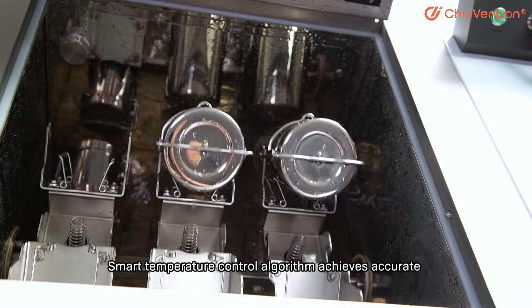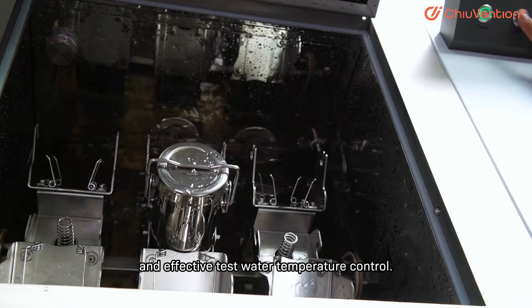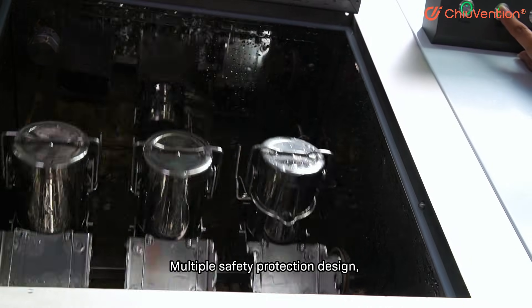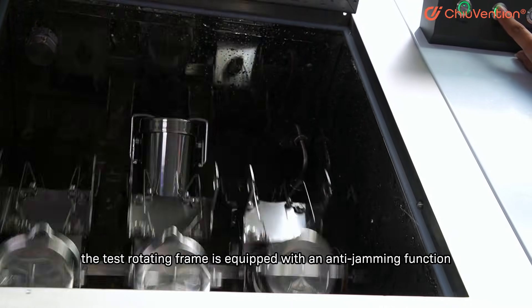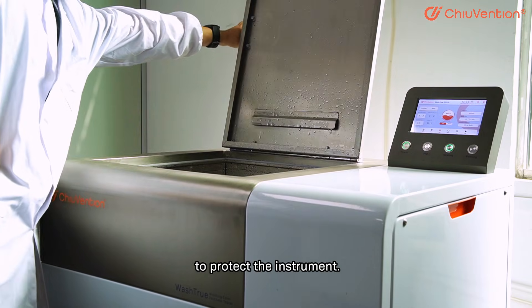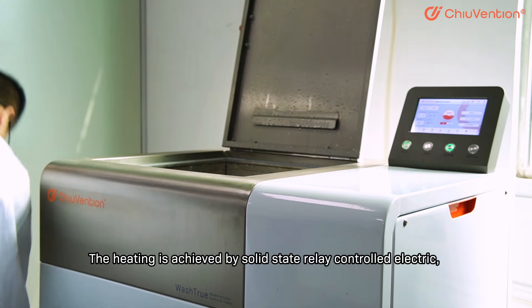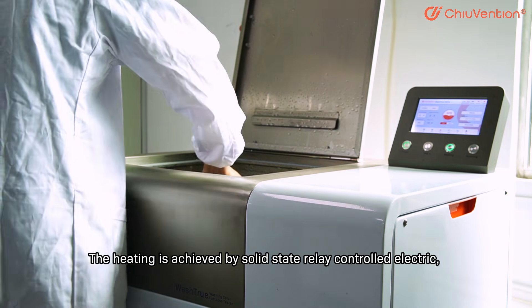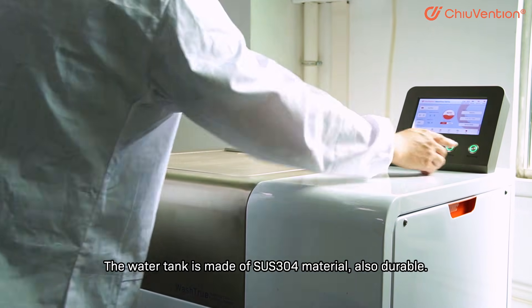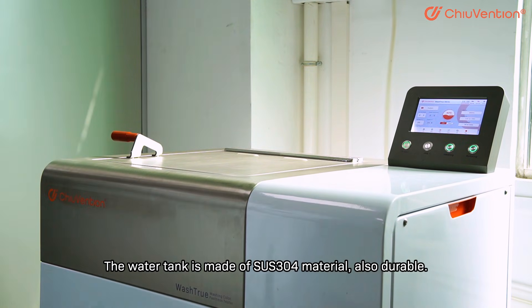The Smart Temperature Control Algorithm achieves accurate and effective test water temperature control. For safety protection, the test rotating frame is equipped with an anti-jamming function to protect the instrument. Heating is achieved by Solid State Relay Controlled Electric heating, bringing more stable temperature and longer service life. The water tank is made of SS304 material, also durable.